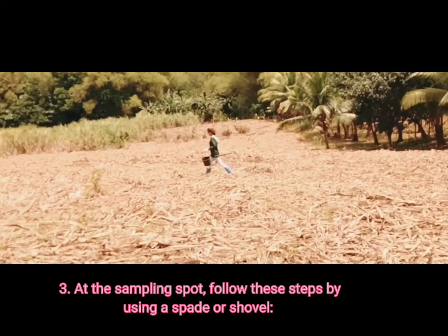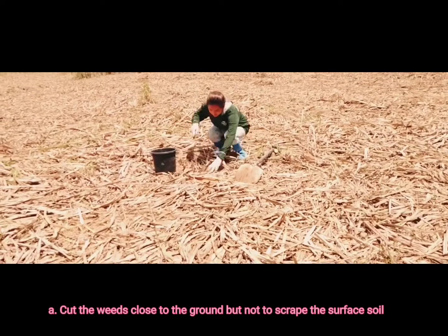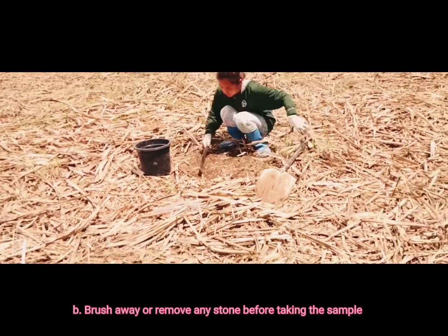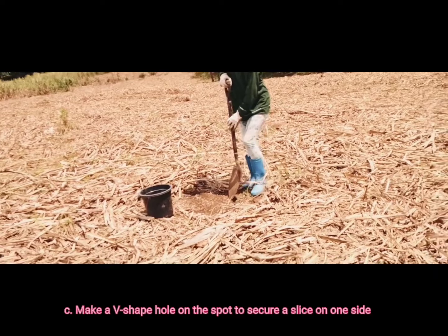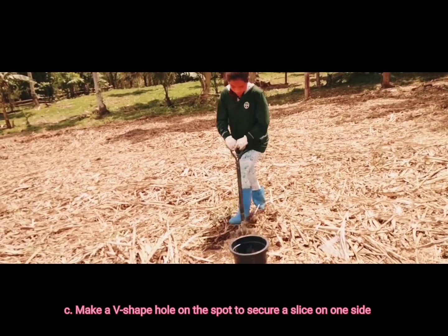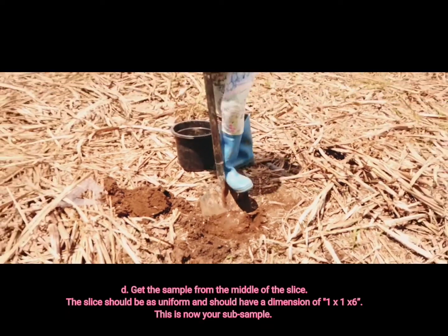3. At the sampling spot, follow these steps by using a spade or shovel. A. First, cut the weeds close to the ground, but do not scrape the surface soil. B. Brush away or remove any stone before taking the sample. C. Make a V-shaped hole on the spot to secure a slice on one side. D. Get the sample from the middle of the slice.